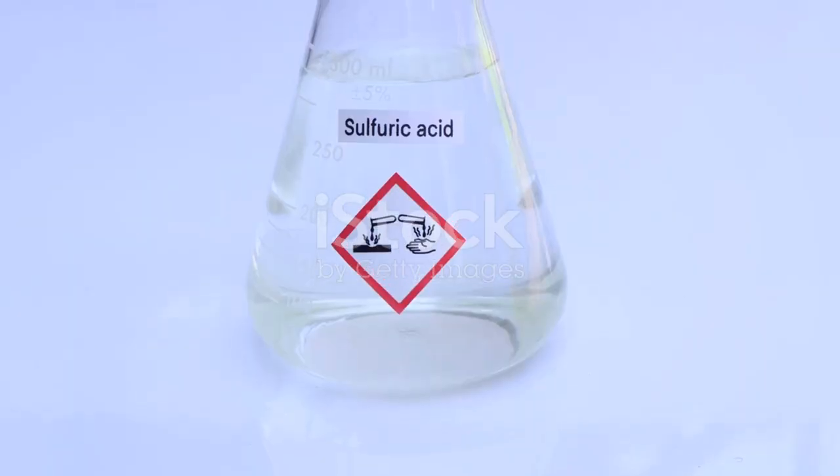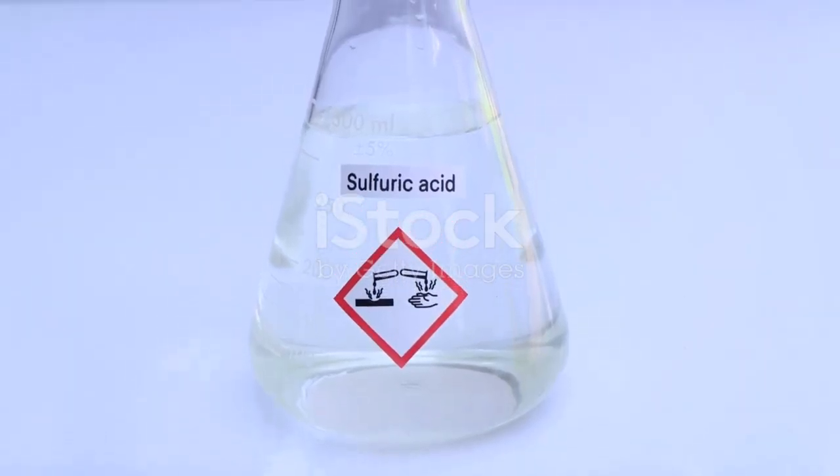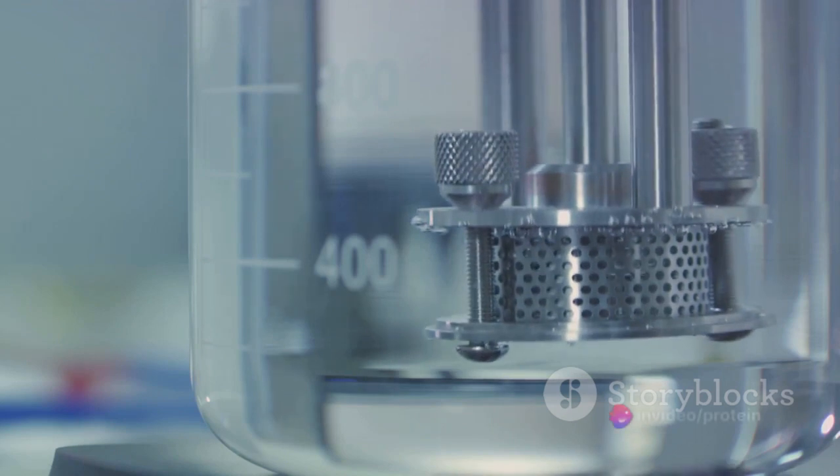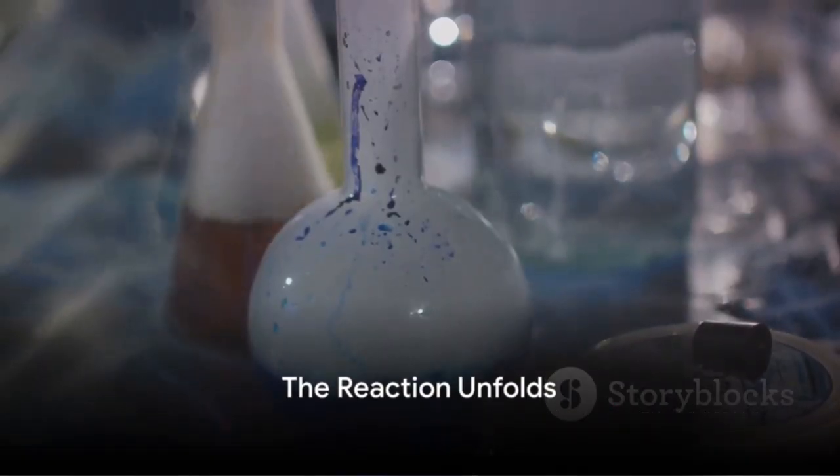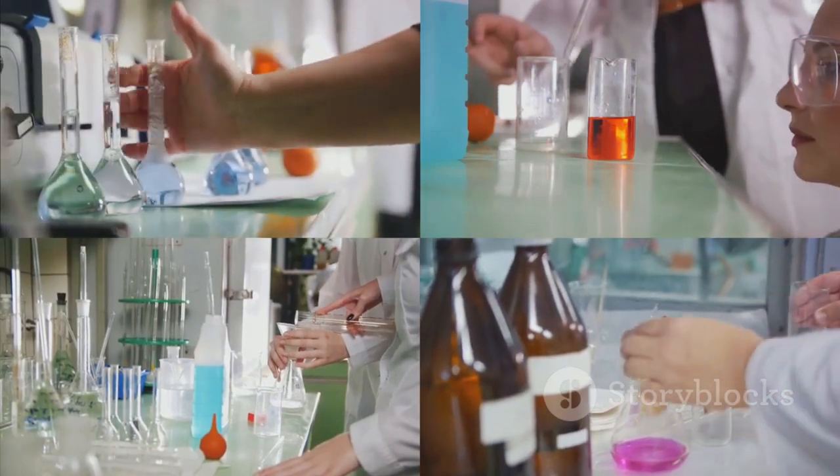The second step introduces the sulfuric acid. Pour the acid gently over the sugar cube. Sulfuric acid, a strong acid, acts as a dehydrating agent, removing water from the sucrose. Now observe carefully. The reaction doesn't happen instantly. It takes a few minutes for the magic to start.